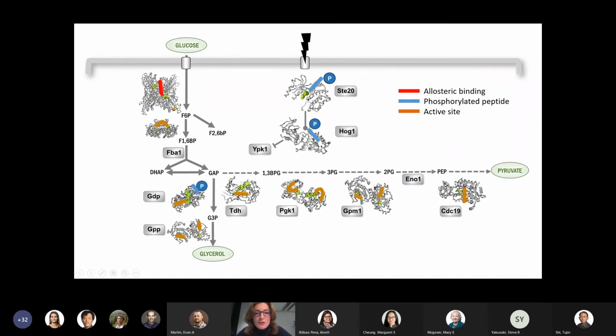And down here, that was particularly unexpected. So these are all enzymes for which not a lot happens, only the concentrations of substrates change as a result of the redirection of fluxes. And here we mostly captured 1 or 2 peptides at known active sites. So we speculated that we might be capturing here changes in the occupancy of active sites, so having more or less a substrate bound to an enzyme.